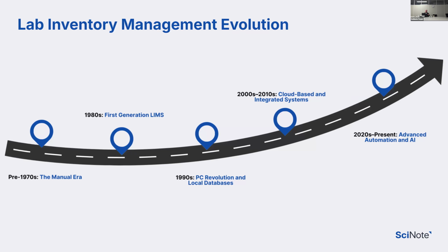But more important, and this is what was missing in the first cloud-based systems, change management is now much more relevant. People don't think just about, okay, we need a software that works, but they also think, we actually need a software that the scientists will adopt, that they will be able to learn, and that is going to be easy to learn as well.